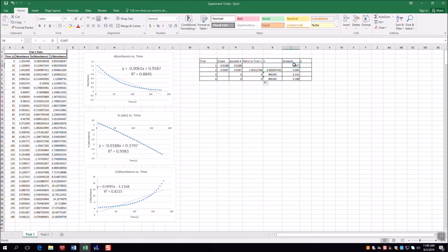Now here I've calculated the concentration of bleach, and if you go into the lab manual, it goes through how I did that exactly, but essentially I did the dilution equation for 1 milliliter of bleach at a certain concentration, diluted to 15 total milliliters. And for each of the other trials, I doubled, tripled, and quadrupled the values. So if you look at my equation, it's just the initial bleach concentration times 2, times 3, and times 4. So now I need to solve for my k.